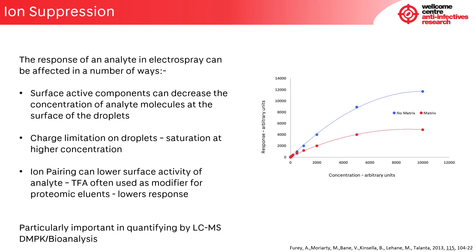As seen in the previous slides, the electrospray is sensitive to surface activity, and there are a number of ways in which the response of an analyte can be affected during the ionization process. The presence of surface active components can reduce the concentration of an analyte at the surface of a droplet and therefore its response. This can be seen most clearly by comparing calibration curves of an analyte prepared in solvent, shown in blue, against that prepared in a matrix such as plasma or serum, shown in red. There are a number of surface active species present in plasma or serum and they reduce the response of the analyte.